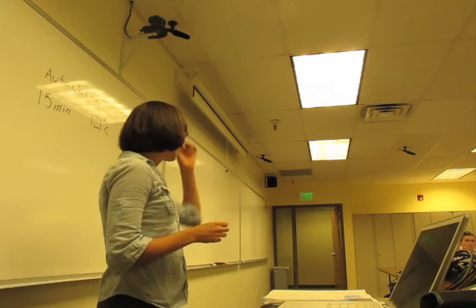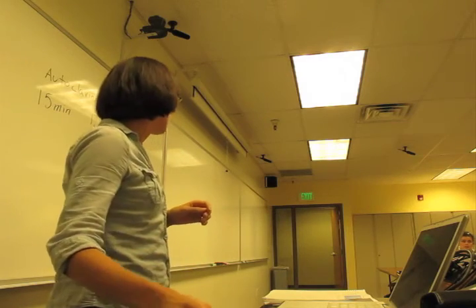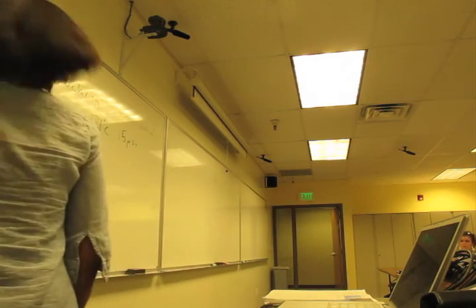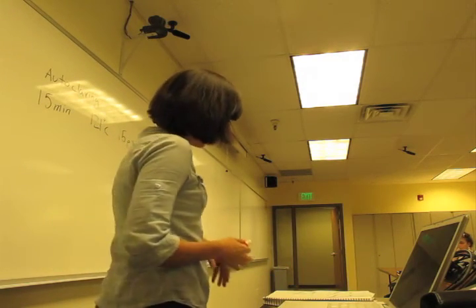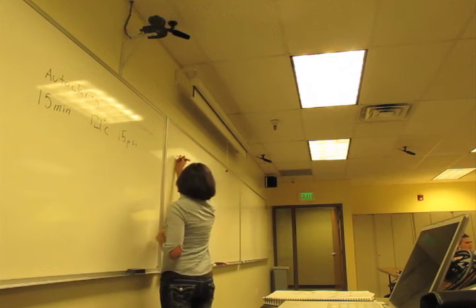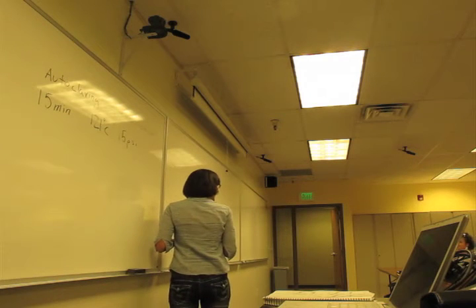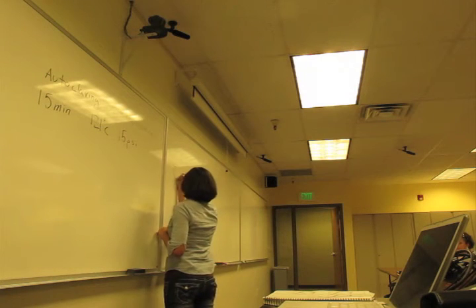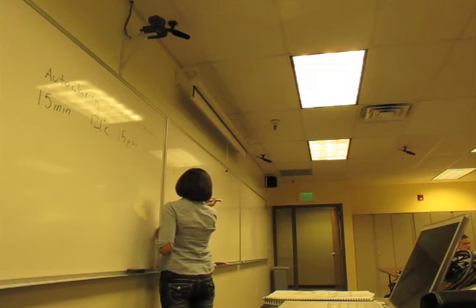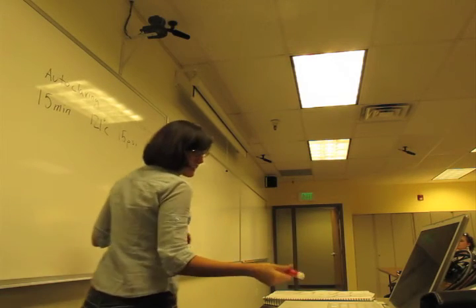I don't know if this will help, but what we did is we made an acronym of the steps. Just do the first letter and then make a funny sentence or a funny word that you would remember. So you start with C, like carbol fuchsin? Yeah. Then it was carbol fuchsin, heat, safranin? No, acid alcohol. Acid alcohol. And then the counter stain. Oh, it was wash.